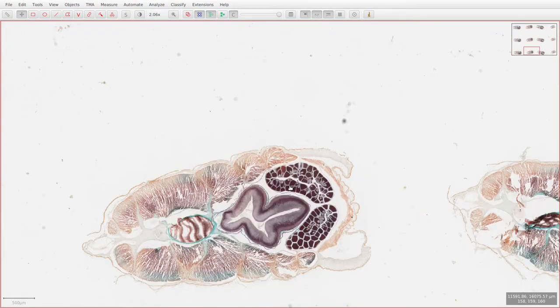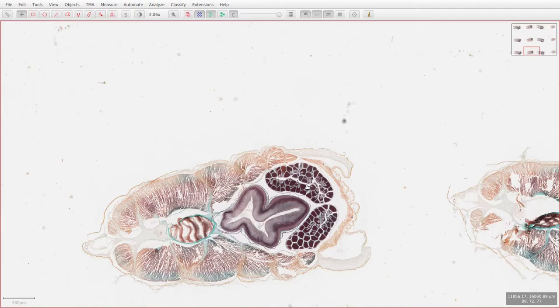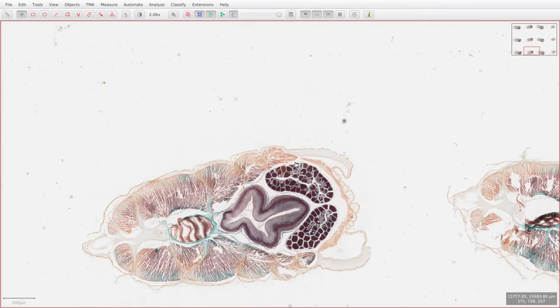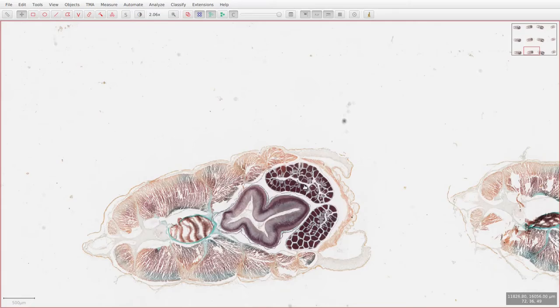If we move on now to the reproductive system, these sections are taken from a female amphioxus, and we can see the two ovaries here in this section as large organs on either side of the pharynx or the digestive system.